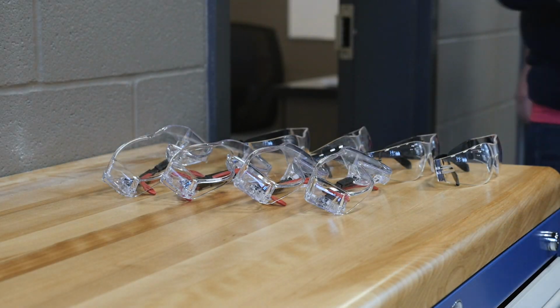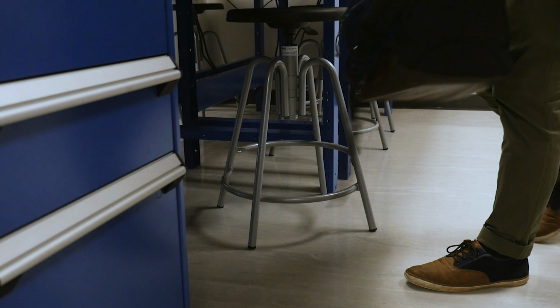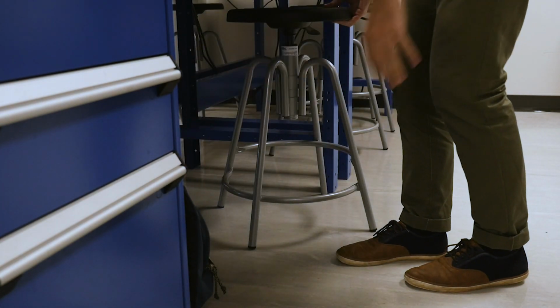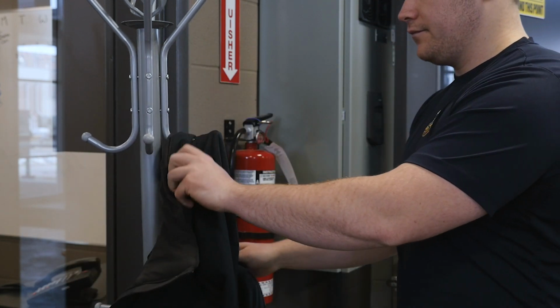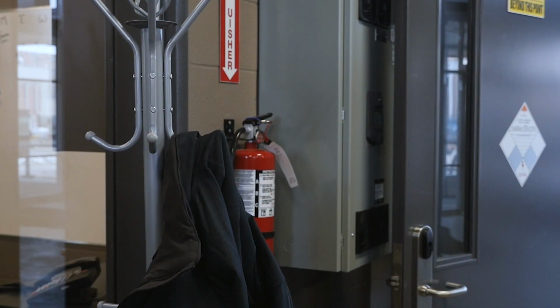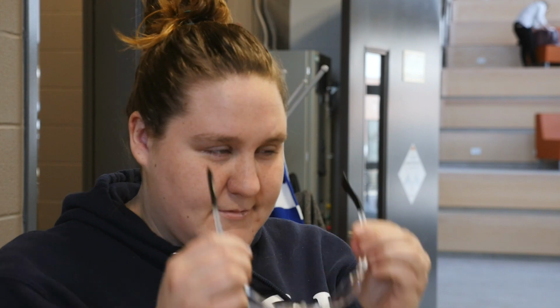Put on any personal protective equipment that is required for the lab room. To avoid creating trip hazards, place your kit bags, coats, and any other large objects well under the workbenches, on the tabletops off to the side, or hang on hooks if available. Tie back long hair, remove neckties, scarves, long jewelry, and avoid loose clothing around mechanical equipment.